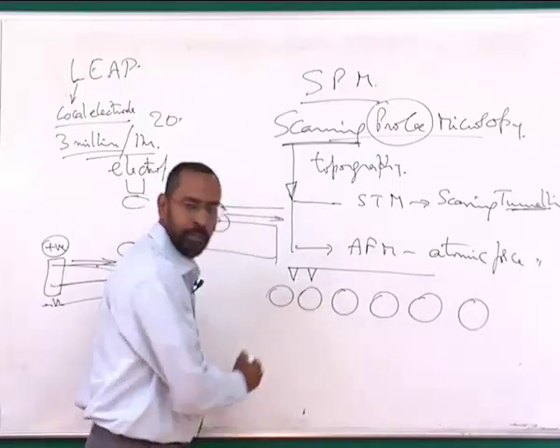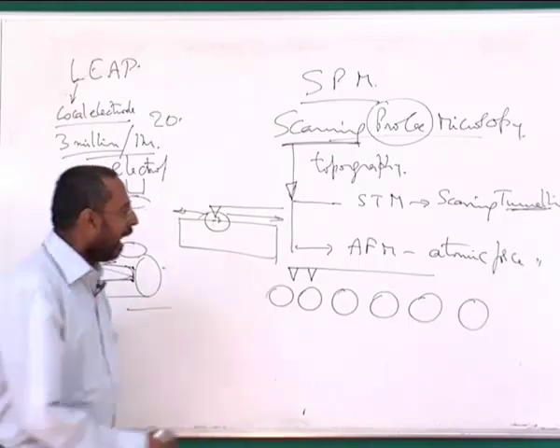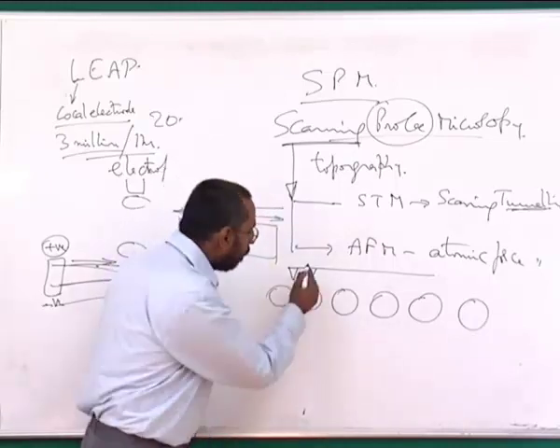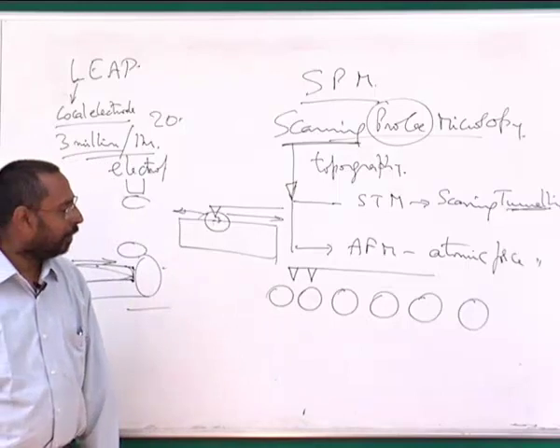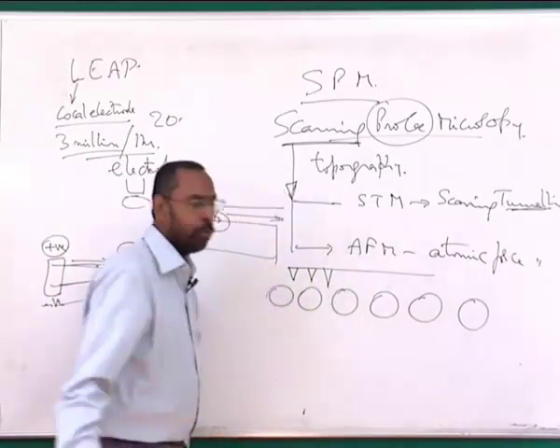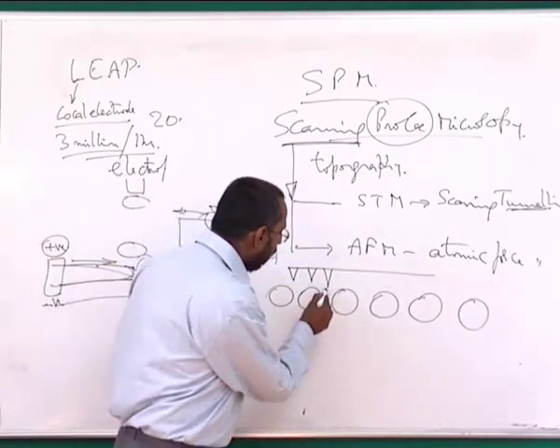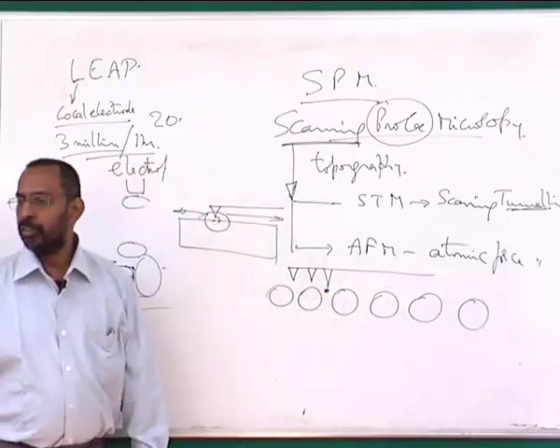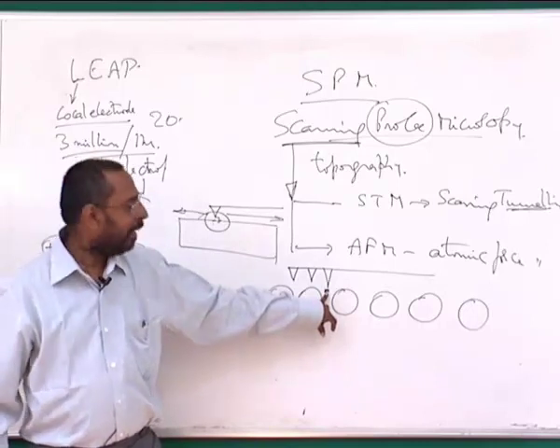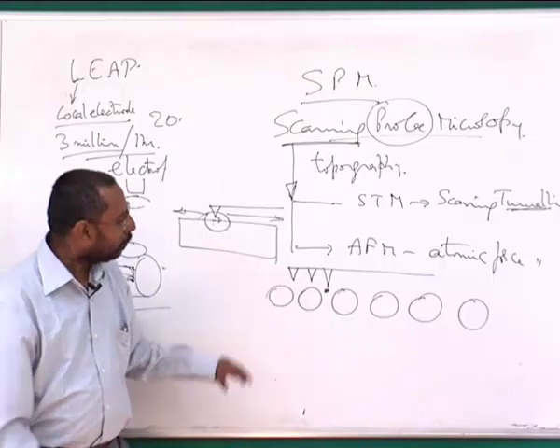because this is an atom containing a certain number of electrons, there is a certain electron density there, and as a result, if this tip is close to this, there can be a tunneling that can happen between these two. And the moment the cantilever comes to this region, because you are maintaining the distance, you see here the electron density is smaller. So as a result, it feels that there are fewer electrons, and you will not see any tunneling taking place.